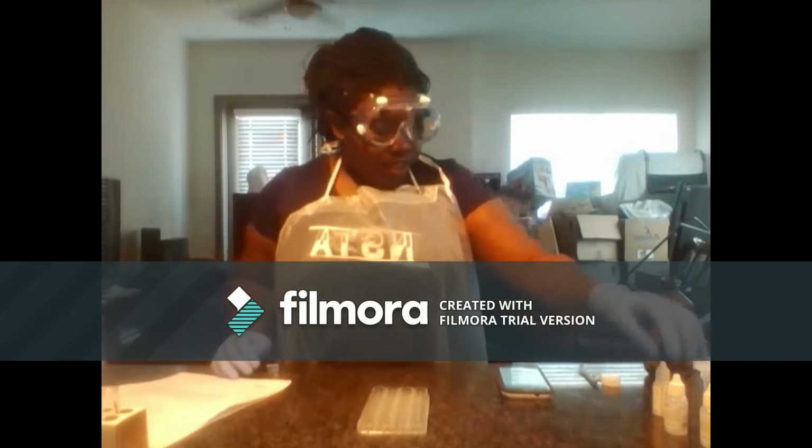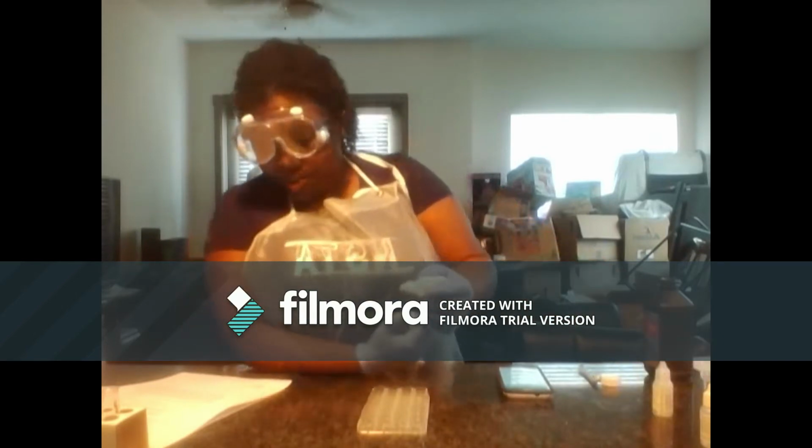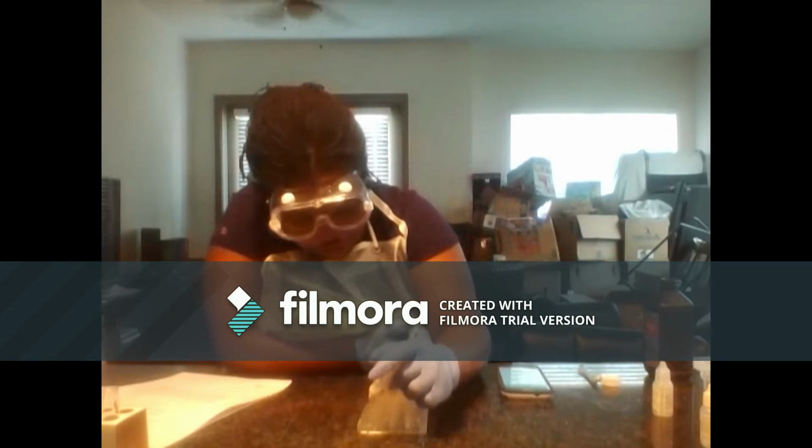Alright, so we're going to start with the calibration test activity. And I'm going to put 8 drops of potassium iodide in this top left well plate.